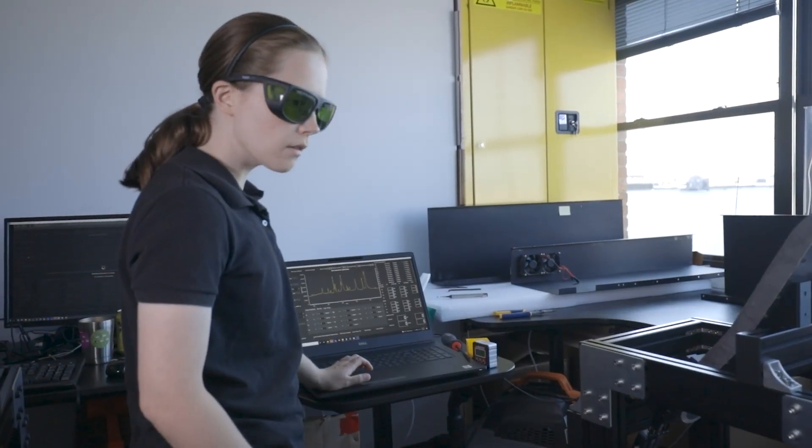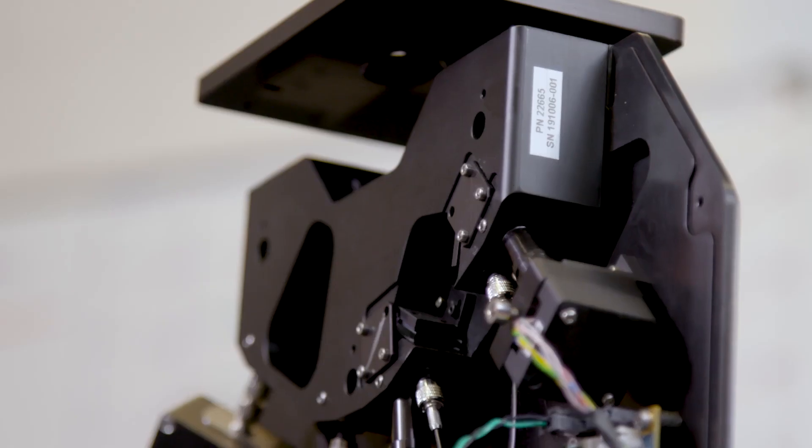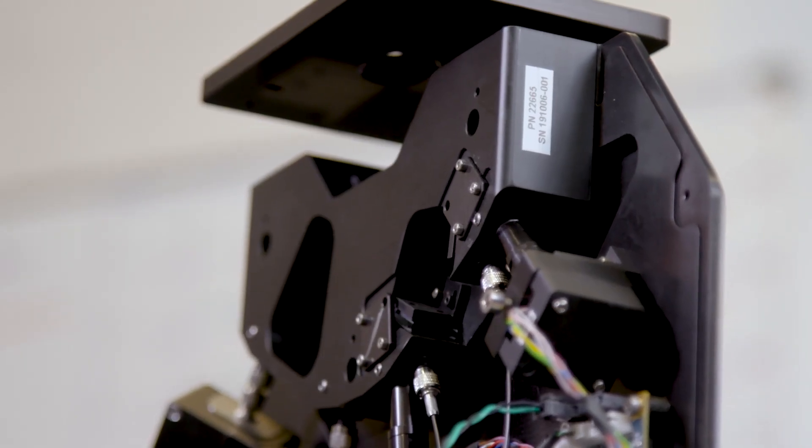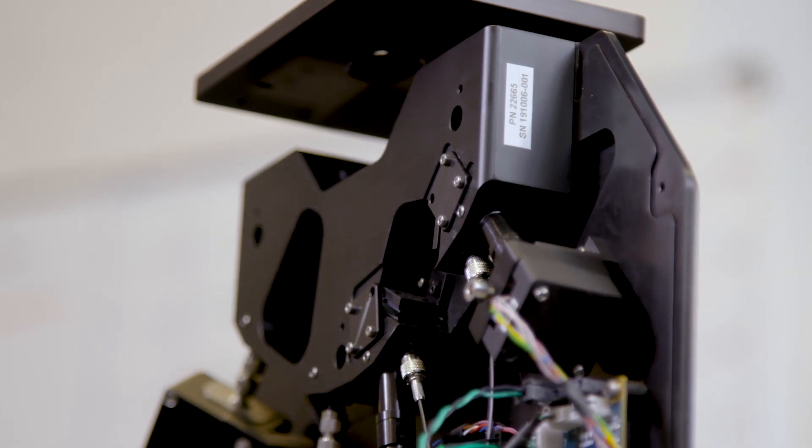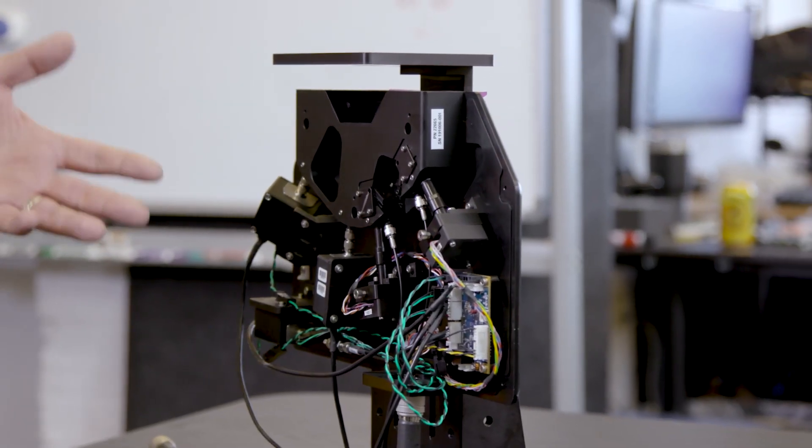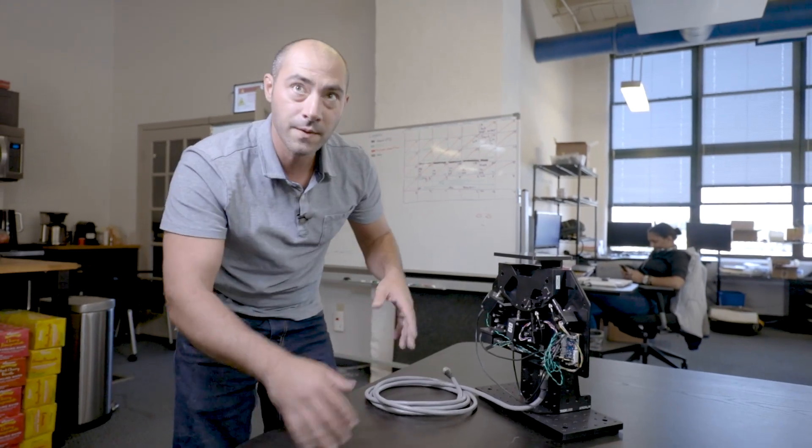We're kind of the biggest users of Ocean's core products. They make these spectrometers and we're integrating them into real systems. So this is a multi-angle color measurement device: two light sources, three spectrometers, 35 optical elements.